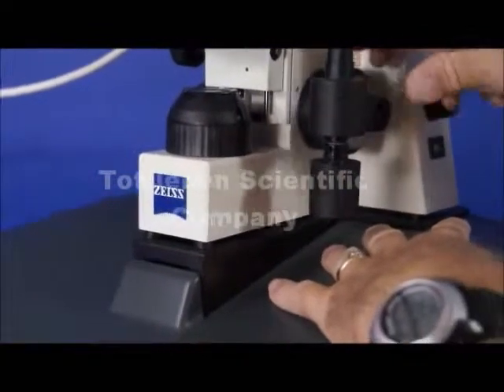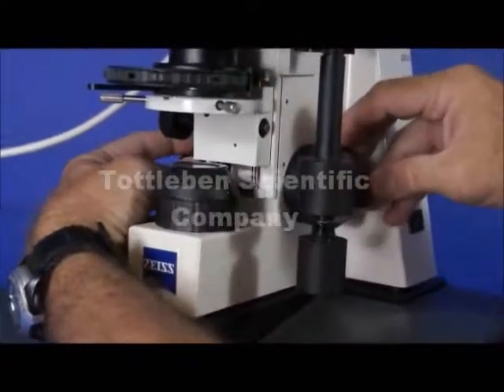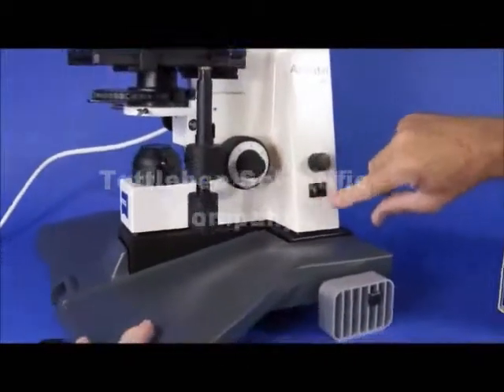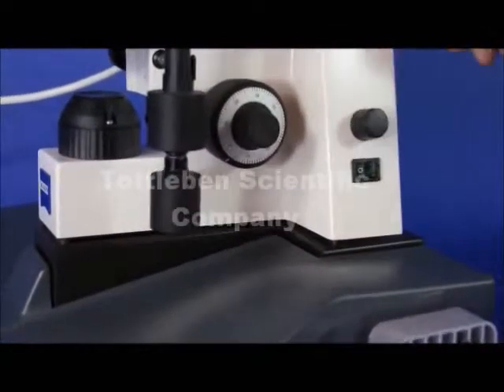This microscope is also equipped with coaxial coarse and fine focus on both sides of the stand. Moving over to the side, you can see that it's equipped with of course the on/off switch and a rheostat for increasing or decreasing the intensity.